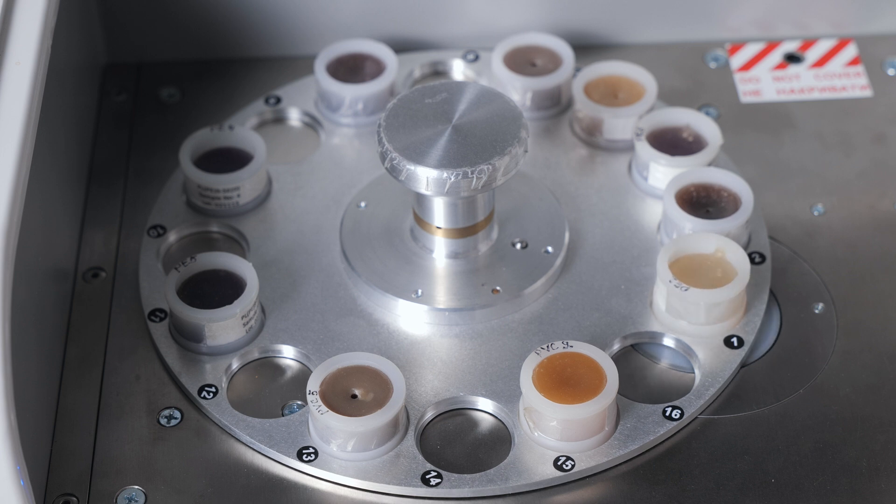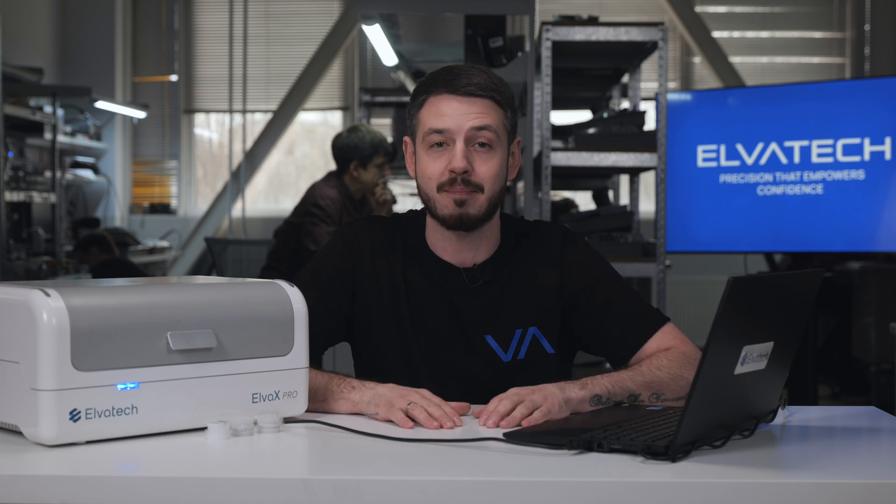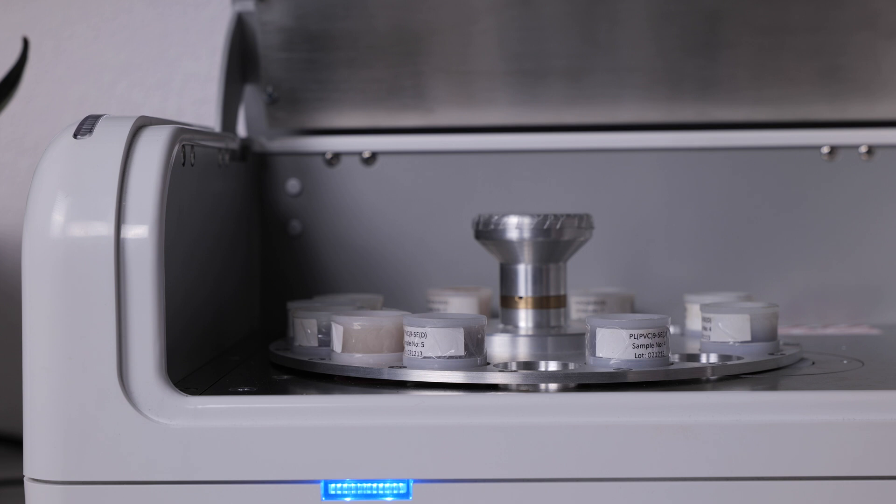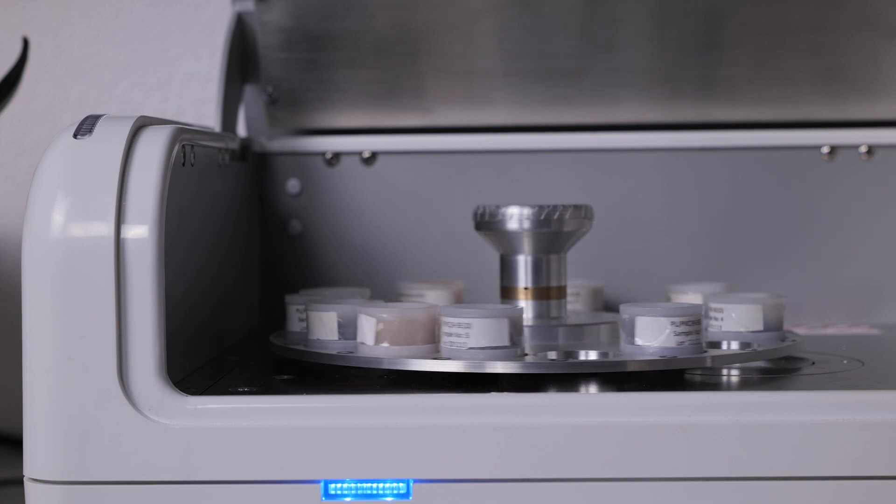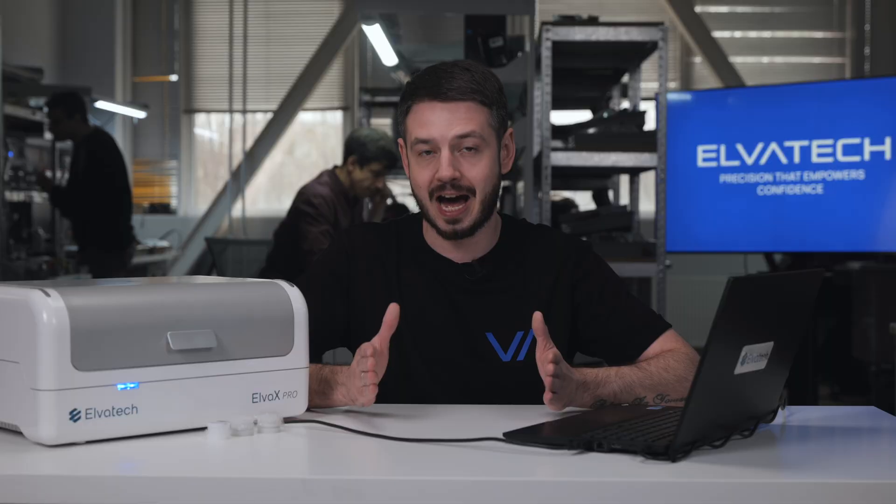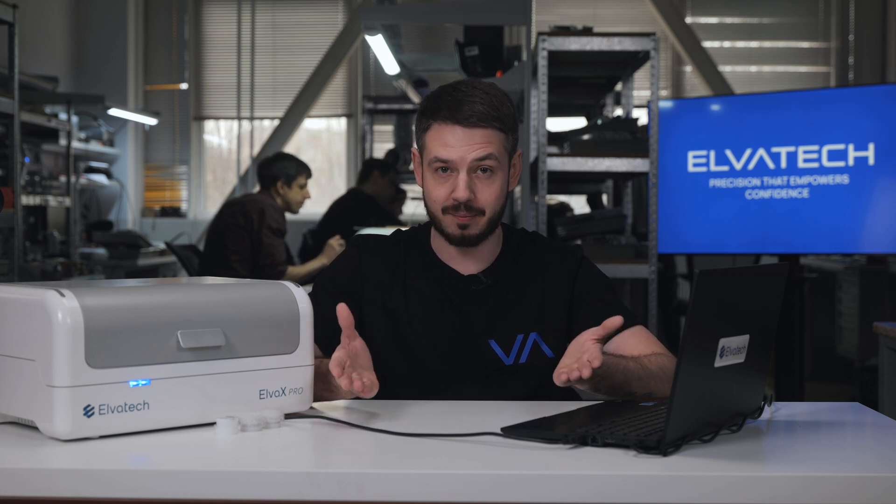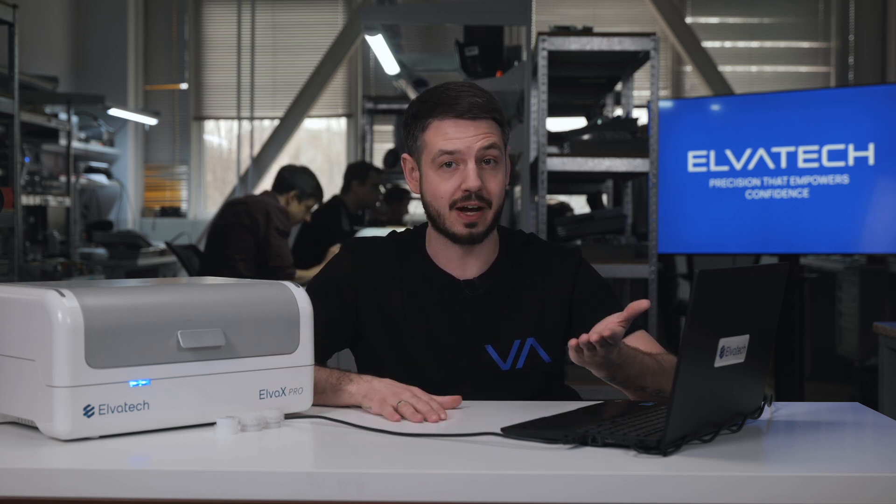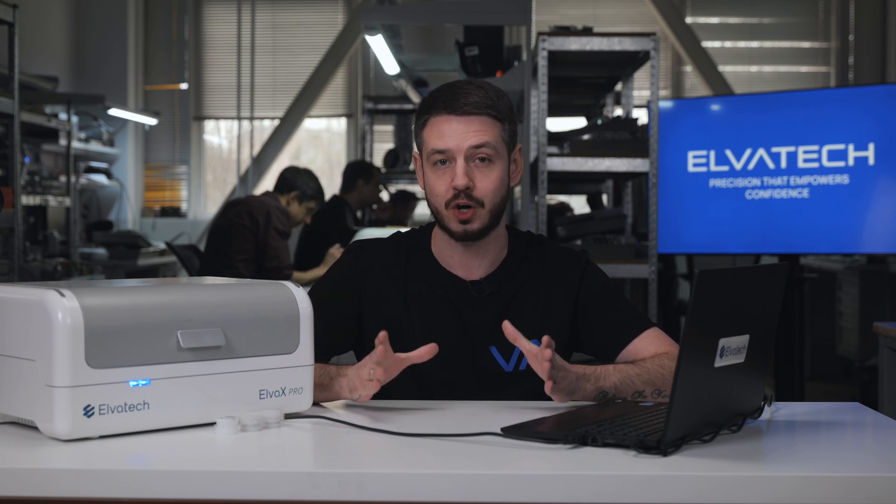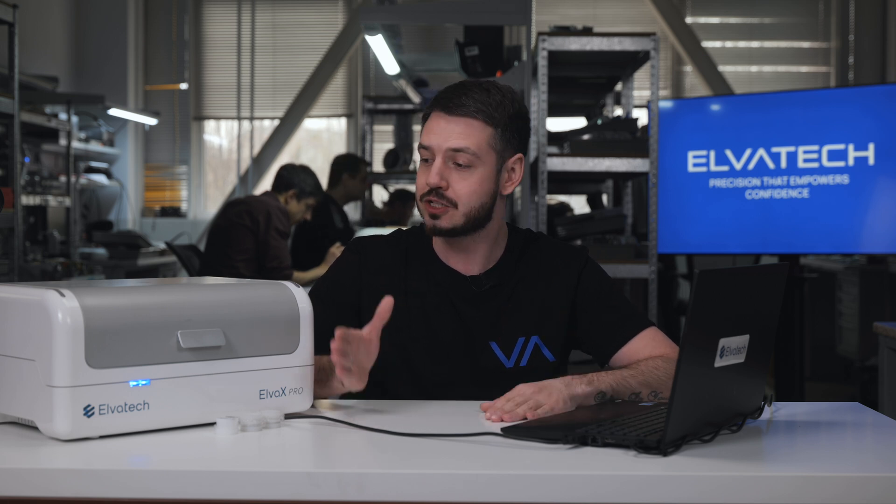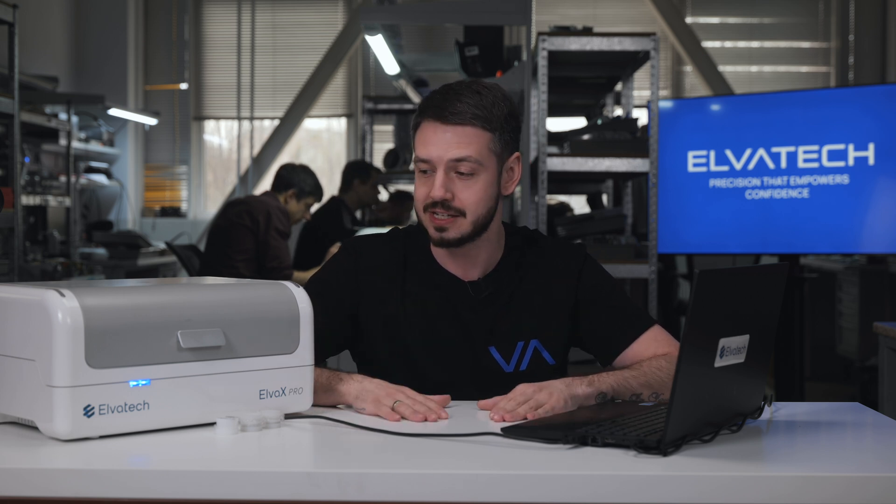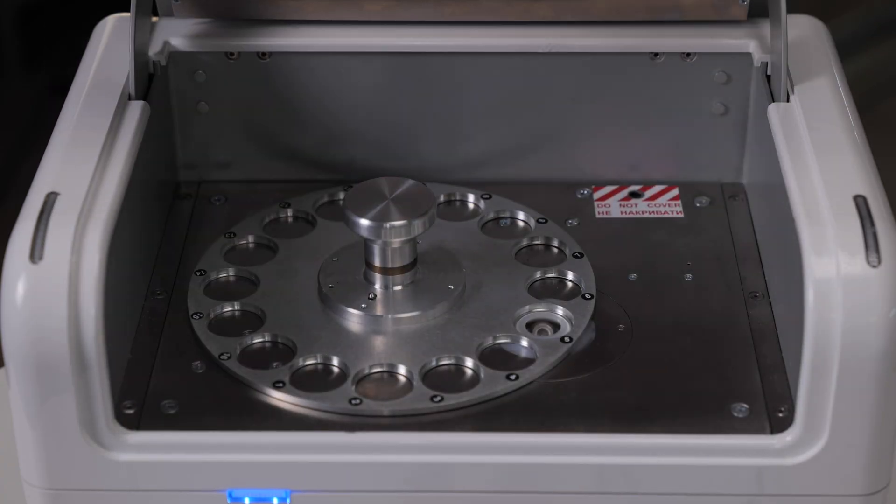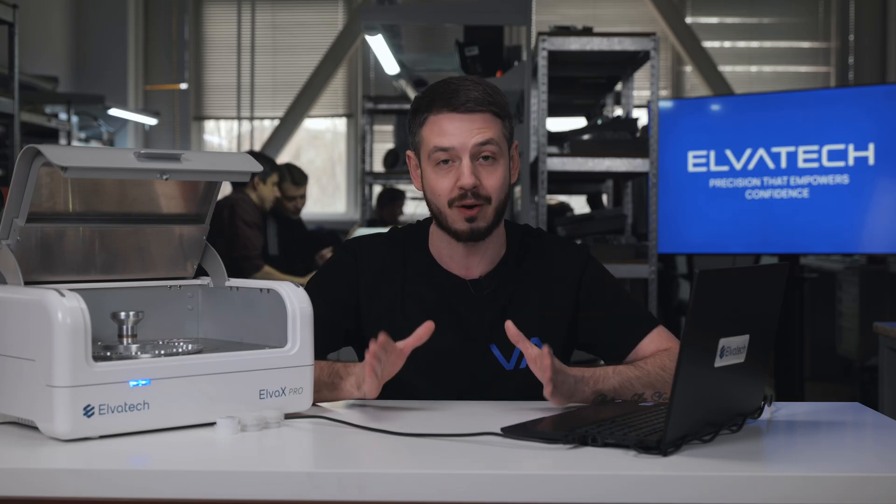It also features a 16-position automatic sample changer and automatic sample rotation, making it ideal for routine high-throughput analysis in cement plants or QC labs. Let's see how Elvox Pro helps you monitor cement composition with unmatched accuracy and efficiency. Let's head to our experiment. First of all, what we need to mark and even underline: all the cement analyses are available only if you have your device with a helium purge option, because all the light materials here will need to be analyzed with helium. The 16-position auto-sample changer and auto-spinner for powder samples would be perfect supporting options for this application.